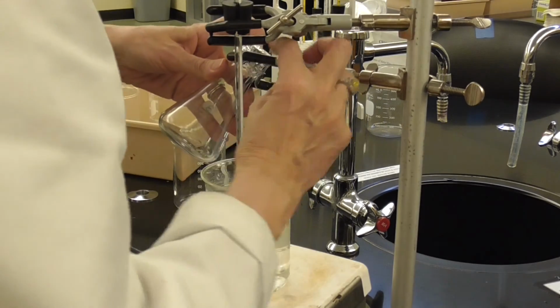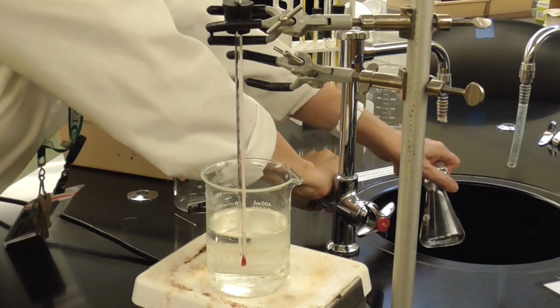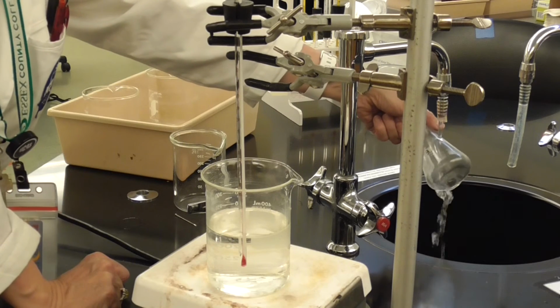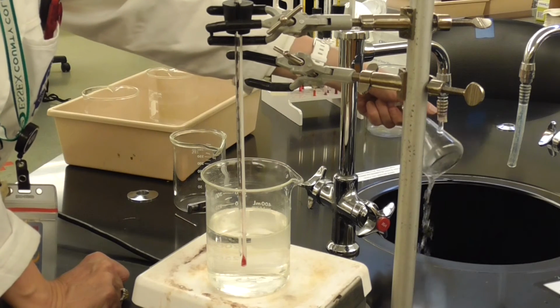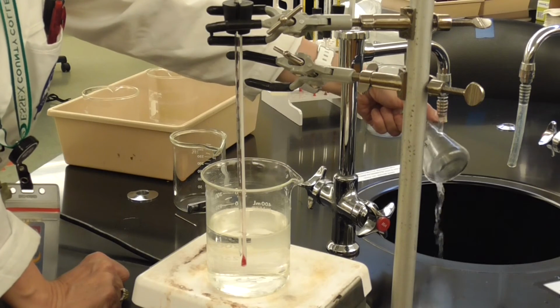And then we're going to take that and put it under the tap water. We're going to have tap water running. So we will see that the volatile, in other words the vapor, is going to be condensed back into the flask.